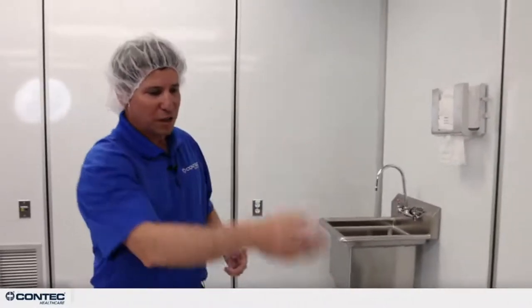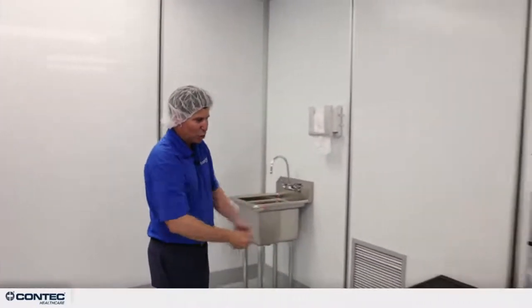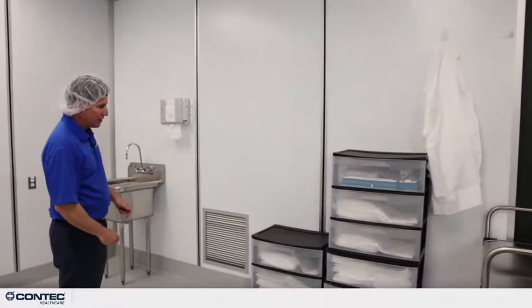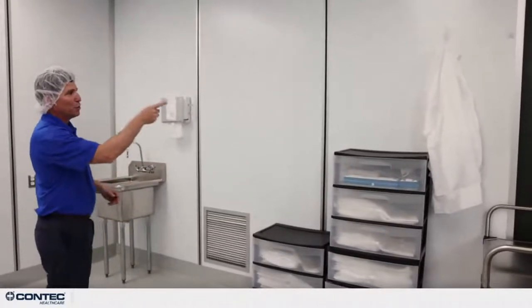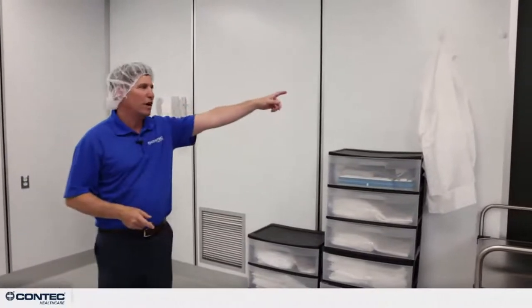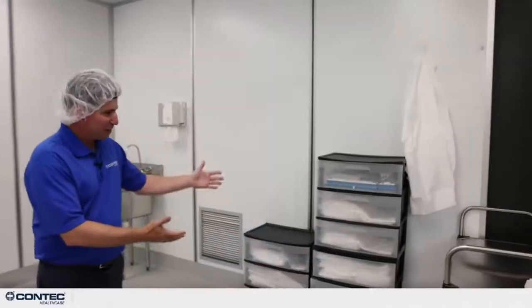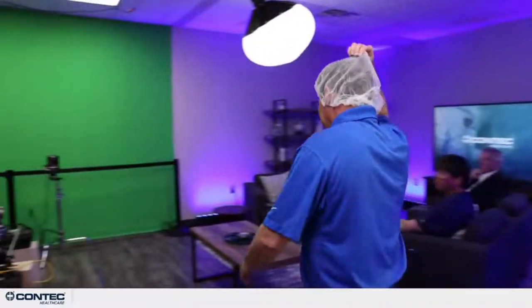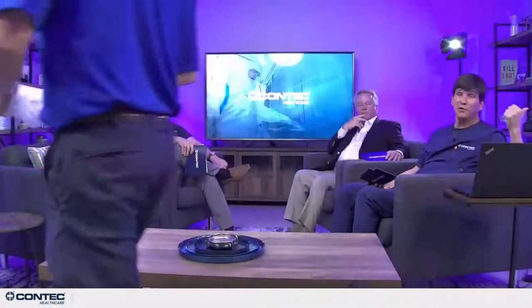You've got your frocks here that are contained in the storage. So again, if any water splashes over, you're not going to have any exposure to that. And if you're going to reuse your gown, we have that hanging up here as well, again away from the sink, so there's no water that could splash over on any of the gowns. So that's how you want to have this set up, and make sure that you have your line of demarcation and put on your shoe covers. Yeah, if you guys grab another shot of those PPE storage bins, I think that's such an important thing. The chapter is pretty specific.